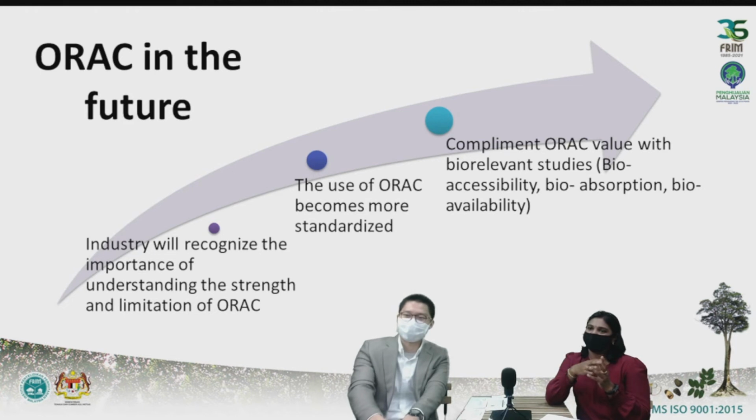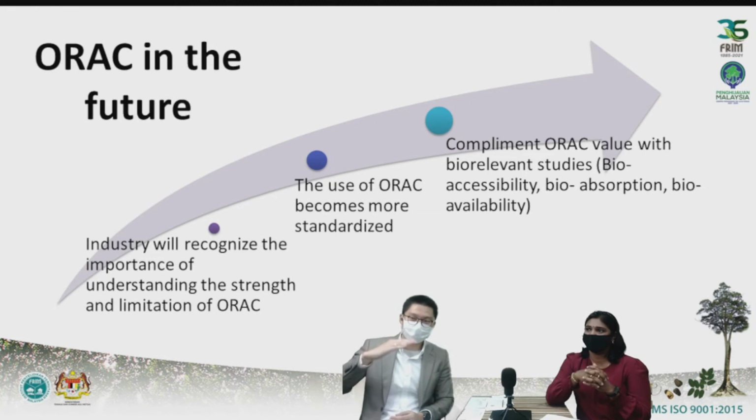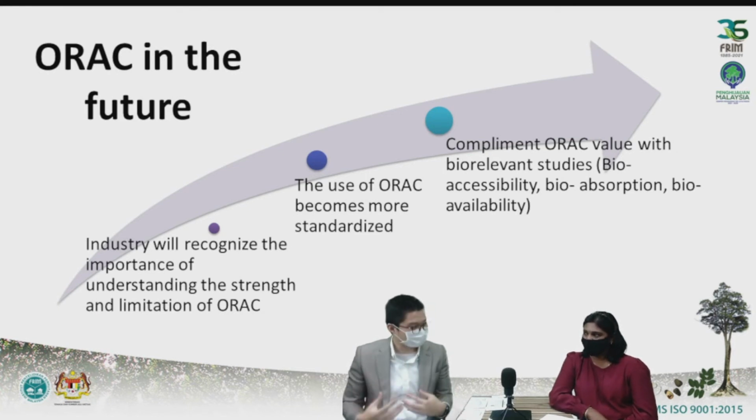Yes. Okay, because I think it's quite important, again, like Shalini mentioned, because the ORAC assay that we do is in vitro. Technically it's on a test tube or a microplate. So again, this does not necessarily correlate to the actual health effects in the body. But moving on the journey towards affirming that, we can do some in vivo studies to see whether the antioxidants are actually absorbed by the cell or not. I think that's quite important as well.